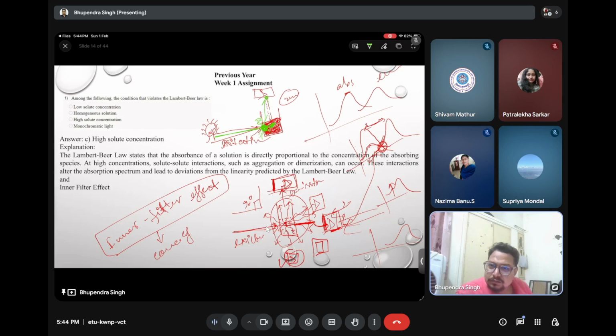Okay, Lambert-Beer law in the case of absorption. I've told you about the case of emission only. The Lambert-Beer law is epsilon c l, and this is absorbance, meaning spectrophotometer, not the fluorimeter. I am telling you about the fluorimeter, so anyway, just remove this. I can tell you this is the detector D.